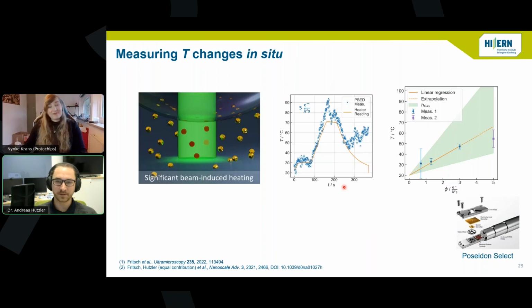However, if you can exclude a movement in Z direction, you can actually also use a two condenser stage system, which we tried out with a Talos F200i. And you can get a certain resolution. You have to make some previous assumptions, like you don't expect any movement in Z direction, which is a bit difficult.